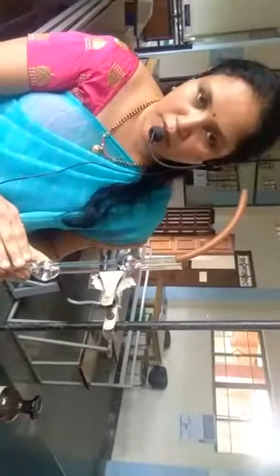Now, before doing it with water, I have to take out this organic liquid and wash the viscometer properly. Washing the viscometer has two steps. First you wash it with water, but the organic liquid is just like oil, and you cannot wash oil with water because they are immiscible. So you have to rinse it with acetone. Acetone is another organic liquid, but it dries very fast. So you wash with water and then rinse with acetone. Acetone will be given to you.